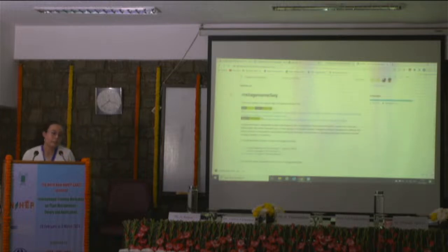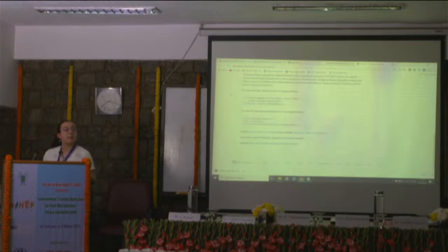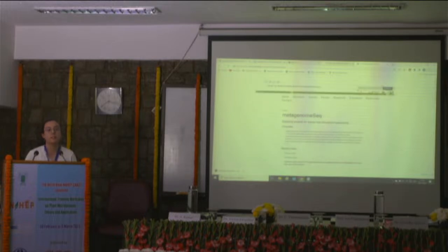you find documentation on it. So you have a description of what it does. Sometimes they explain how you can install it. Some of them give example data that you can use to run it. It really depends on the people that did this. And they sometimes have websites or wiki documents that really talk about everything that the functions do. So if you're very interested in it, or you're writing a paper and you want to be very specific in the methods, you can go and access the documentation and try and understand better what is going on in there.